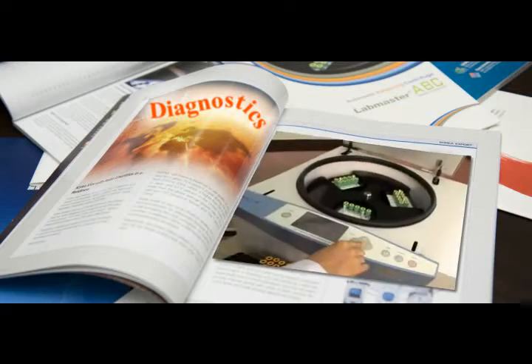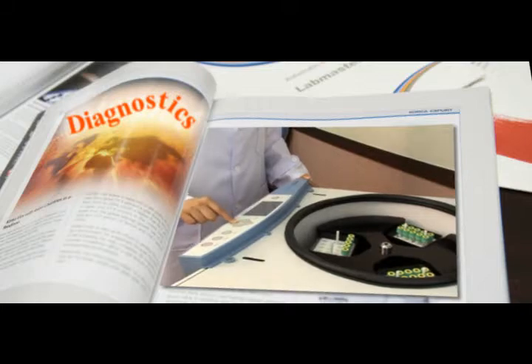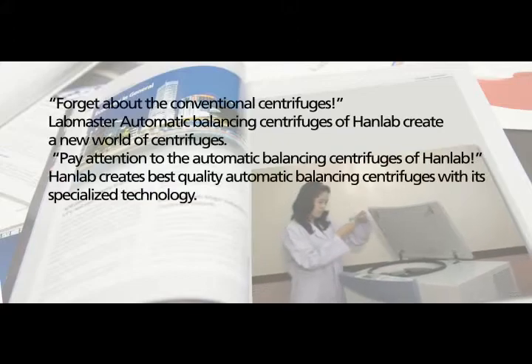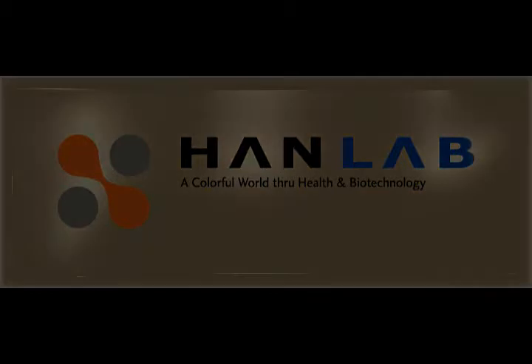Forget about the conventional centrifuges. LabMaster automatic balancing centrifuges create a new world of centrifuges. Pay attention to the automatic balancing centrifuges of HanLab. HanLab creates best quality automatic balancing centrifuges with its specialized technology. Thank you.